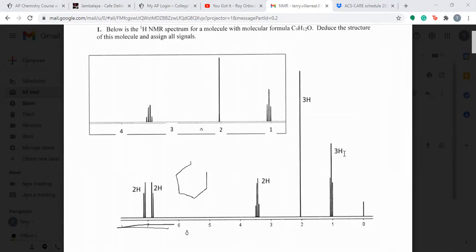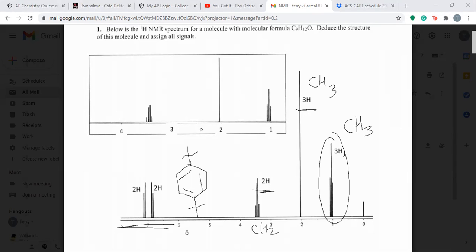So this is what I mean when you just go out and start pulling stuff that you know. Okay. So I have a parasubstituted ring like that. Now, looking at the rest of these peaks, I'm going to have something coming up this way. I don't know what. And then I'm going to have something coming up this way. So what type of functional group is this going to be? CH3. This is going to be a CH3, right? Yeah. What about this one? Same thing. Okay. And this one? CH2. Yep, it's going to be a CH2 probably, right? It's a little above 3, but I don't have anything else that's popping up necessarily in my molecule.